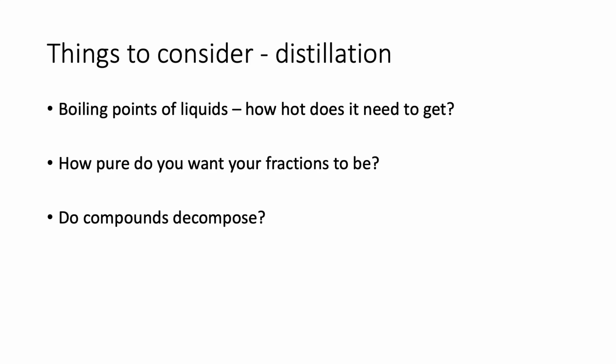So if you don't really care about the purity of your fractions, then you can do a quick, simple distillation, collect your product, call it a day. And then do your compounds decompose if you heat them too high? And in our case, yes, they do.